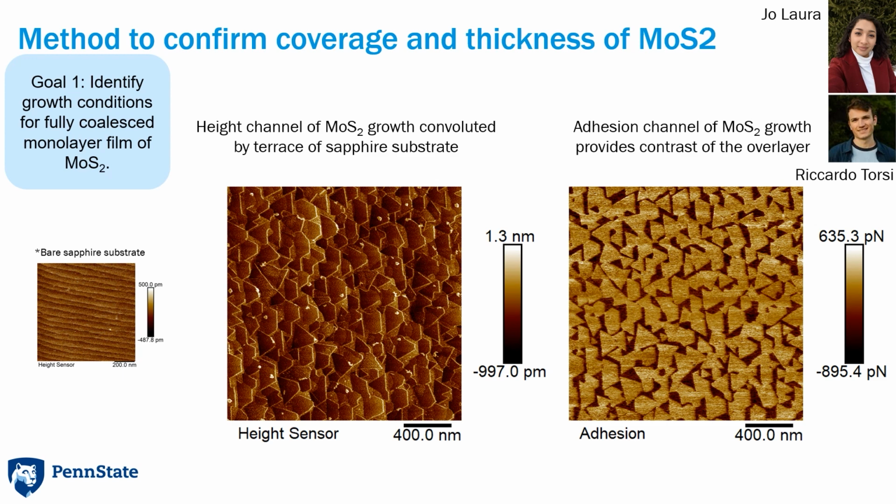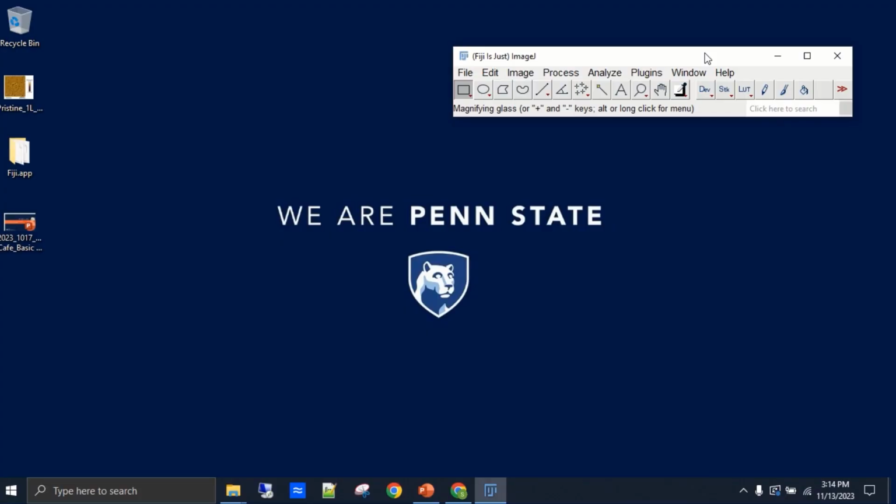And this is where WEKA image analysis helps, and I'm going to give a demonstration of that right now. So I'm going to provide a quick overview of FIJI.